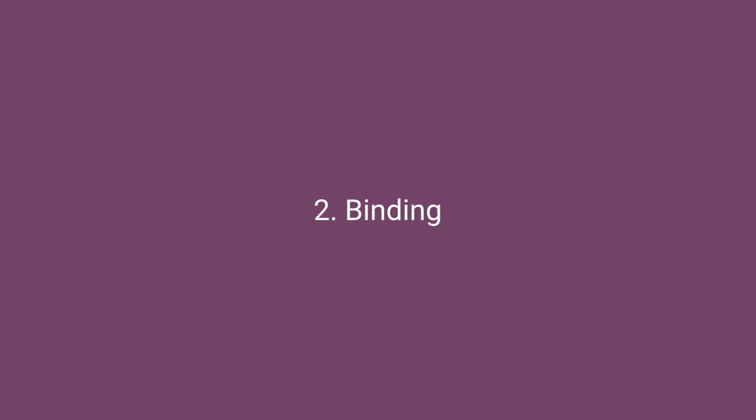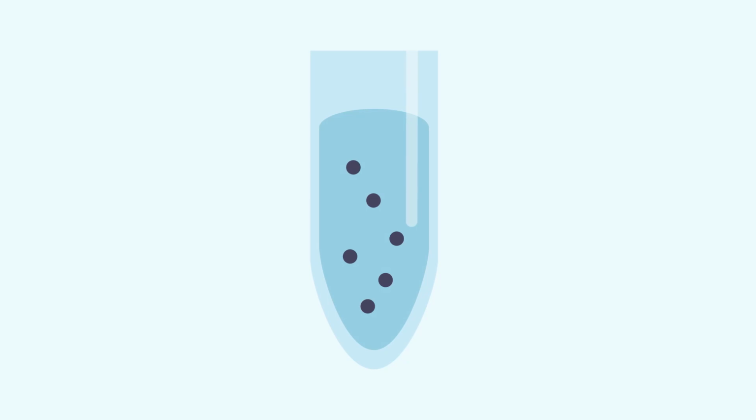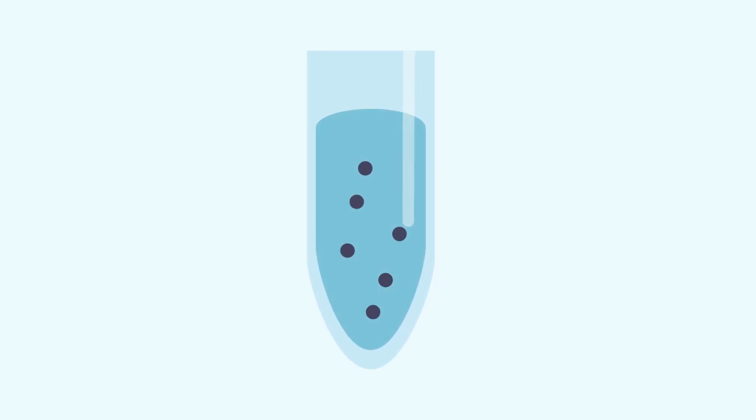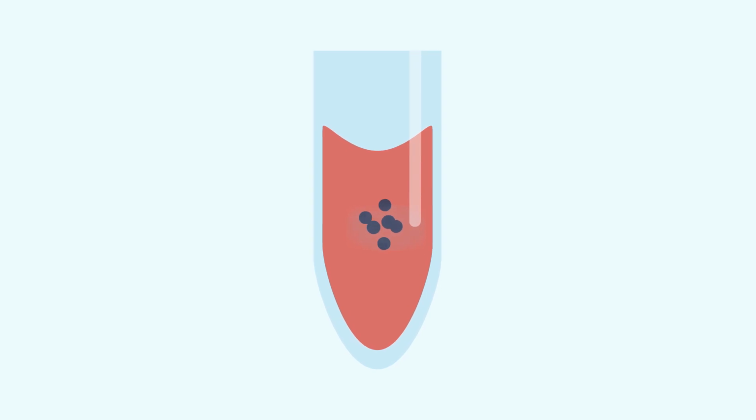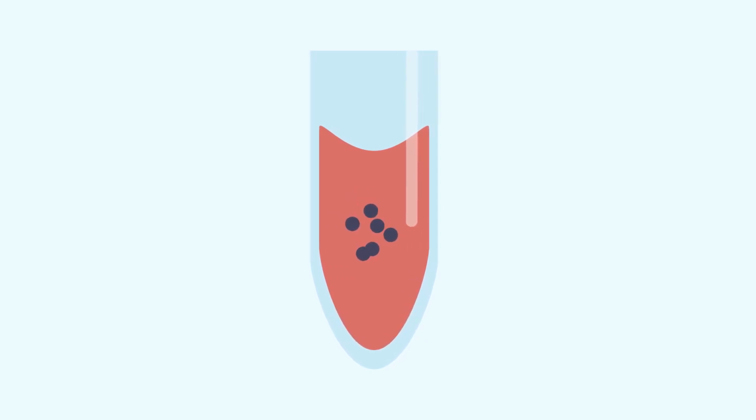This step is all about mixing. Make sure that particles, also referred to as beads, are fully and evenly suspended throughout the sample. If you're using a shaker, watch and make sure a vortex is fully formed. For viscous liquids like blood, it might be hard to resuspend particles once they settle. Starting the mixing before adding the magnetic particles can keep the particles suspended.